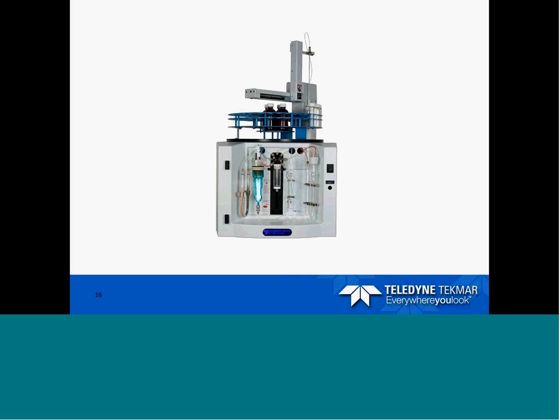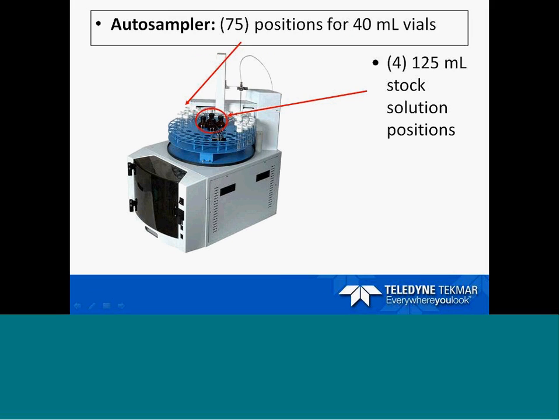So if we go back to center here, this is where it can automatically dilute from any position within the center here, which are your stock solutions, or also dilute from one of the vials as well.